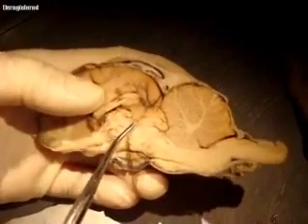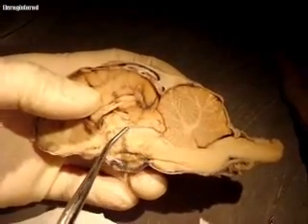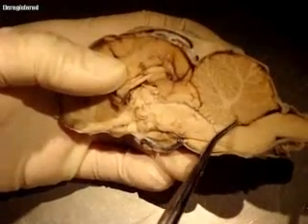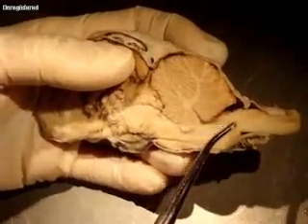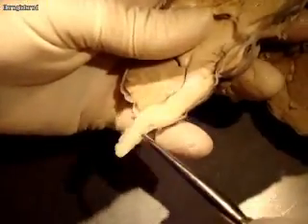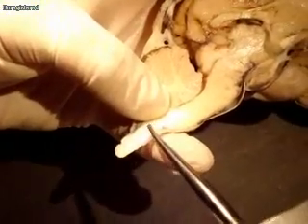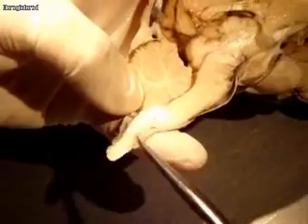Now, the third ventricle is connected to the fourth ventricle by the cerebral aqueduct, which is this little region here. That's cerebral aqueduct. And then here is the fourth ventricle right here. And from the fourth ventricle, it goes down and forms a ridge. Let me see if it's better on this side. Yeah, right here. And that's the central canal. And you can kind of see it as I'm scraping away. This is all central canal. And the central canal is going to be into the spinal cord. Okay.